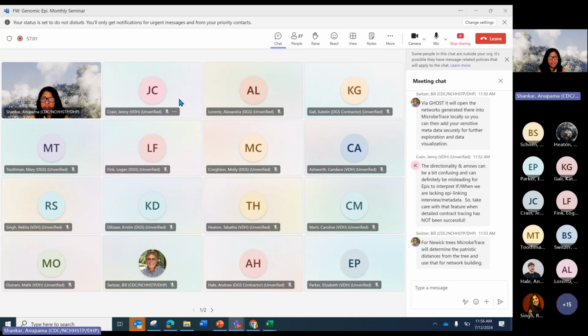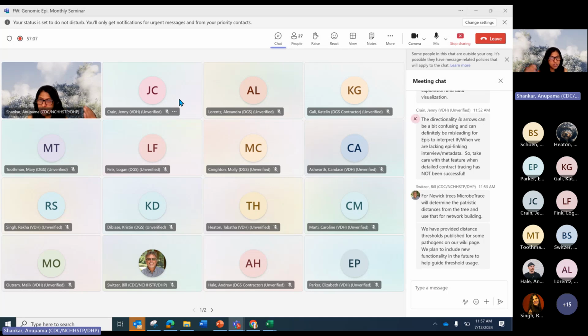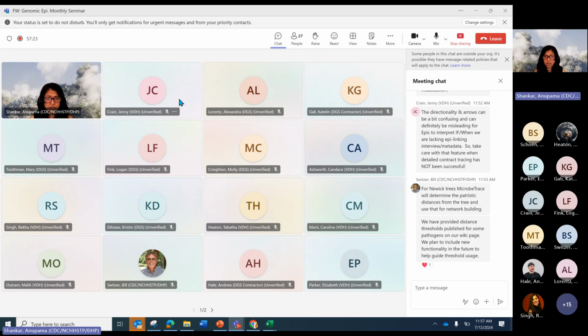If you have no knowledge about the pathogen at all, then you're going to have to use reference sequences or known subtypes, try that a little bit, and find out what threshold works best and gives you discrete clusters. Let's say you have a bunch of different subtypes in your analysis and you know that these subtypes have to cluster together. That's what we did for Hantanet. And then that would be your starting threshold.